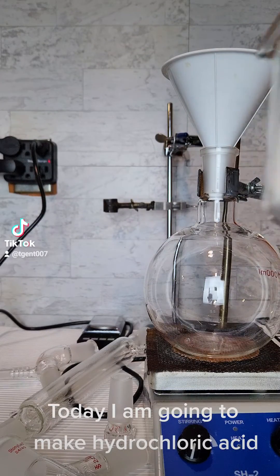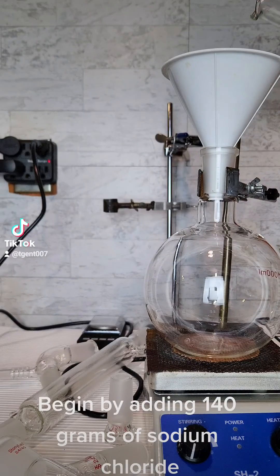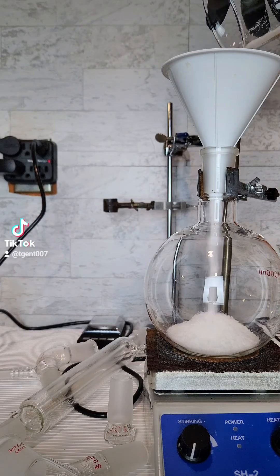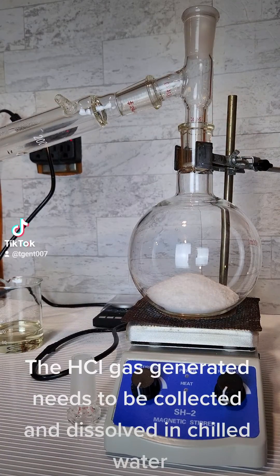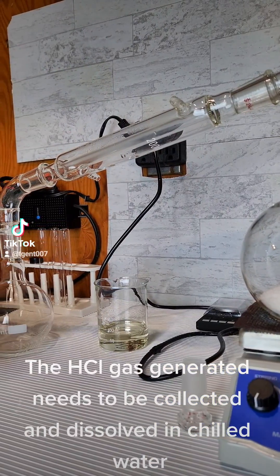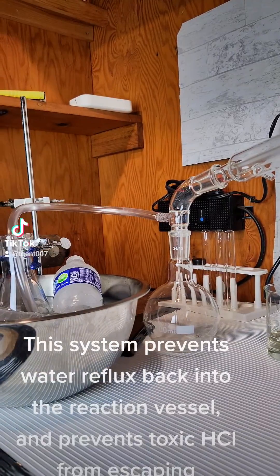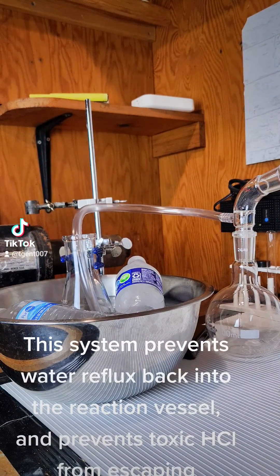Today, I'm going to make hydrochloric acid. Begin by adding 140 grams of sodium chloride. The HCl gas generated needs to be collected and dissolved in chilled water. This system prevents water reflux back into the reaction vessel and prevents toxic HCl from escaping.